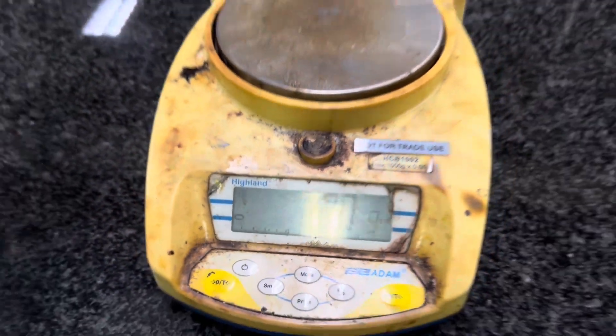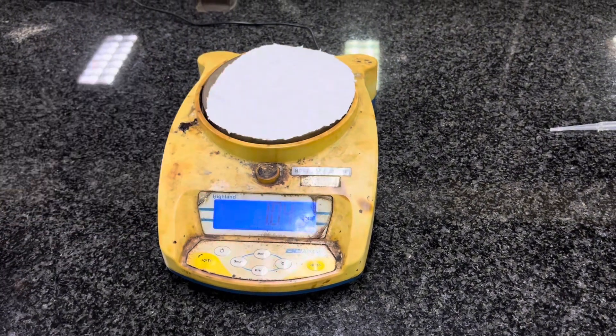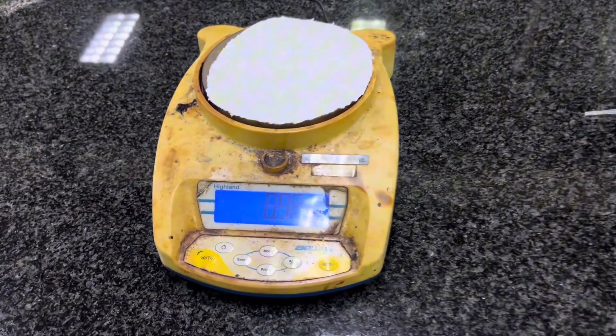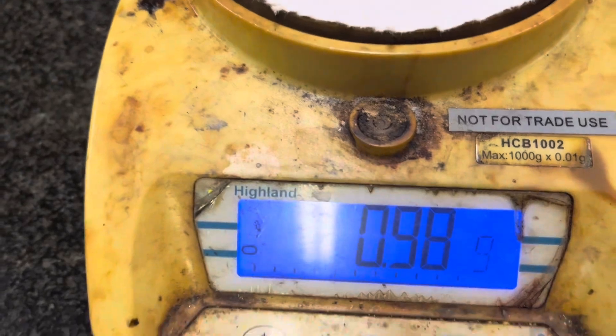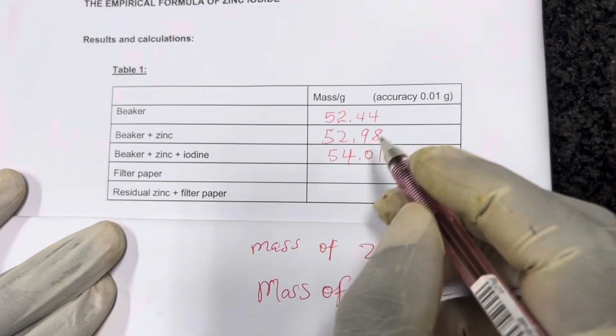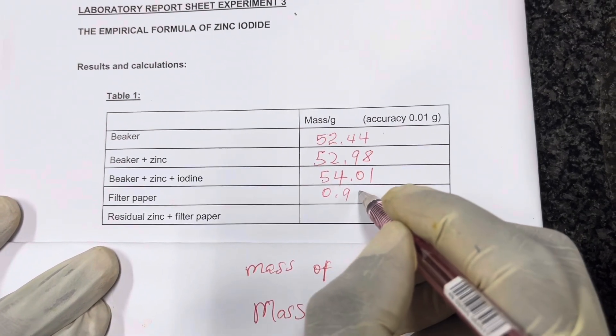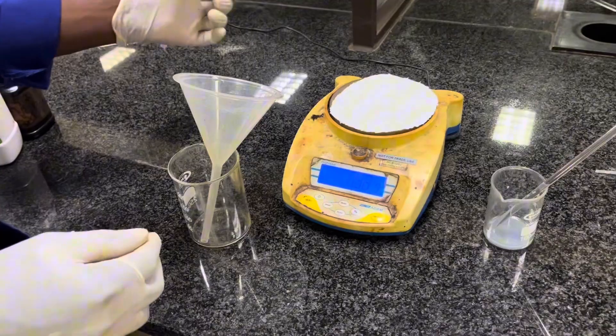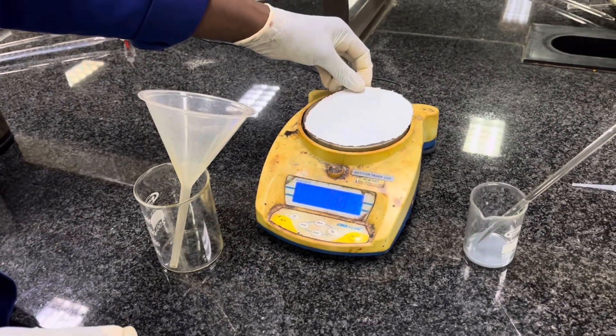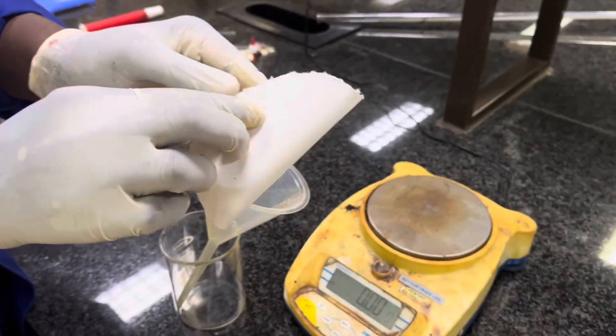Now let's weigh a filter paper. We have the weighing balance is at zero. So we'll put the filter paper on top so that we can get the mass of the filter paper alone. So once we are done with that, we'll record the mass on our table. The mass of the filter paper, here it is. We'll record it on the table. So that we can use it while knowing its actual mass.